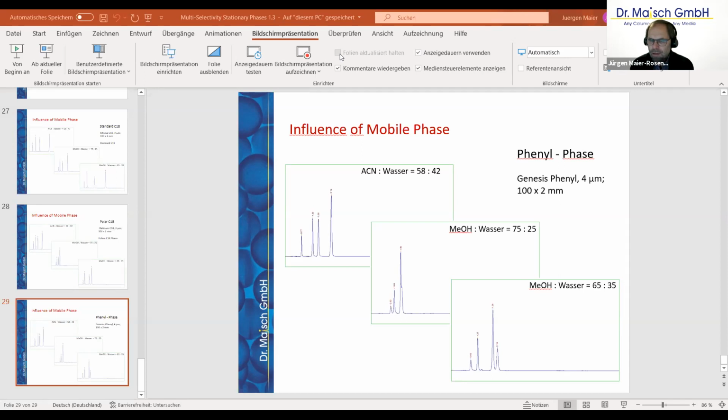Of course, it's always important to double check the solubility of the buffer due to the fact that you are using very high concentrations of organic modifier, and you have always to check if your buffer is soluble in these high concentrations. So you get no precipitation when you mix it. Is that also the answer to the question whether or not you can use methanol? Yeah.